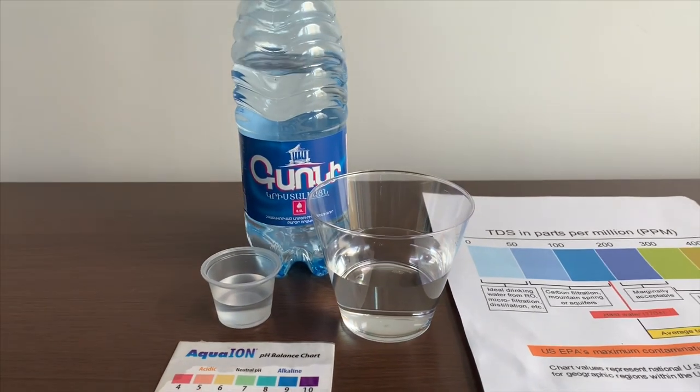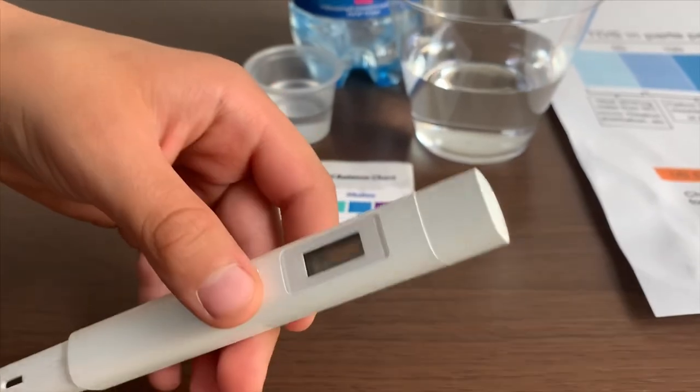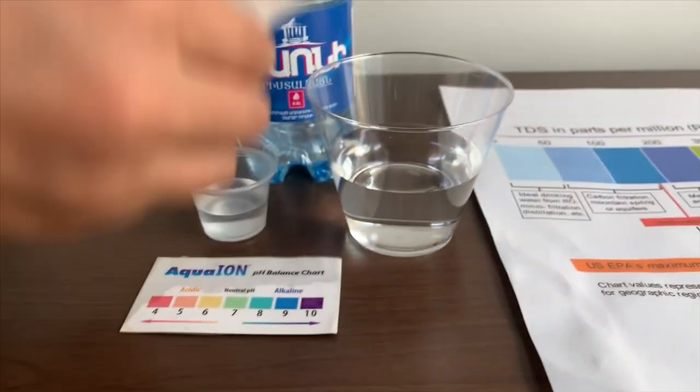First we're going to test the TDS level. If you want to buy this TDS tester, check the link down below. Turn on the TDS tester, make sure it says zero and put it in.